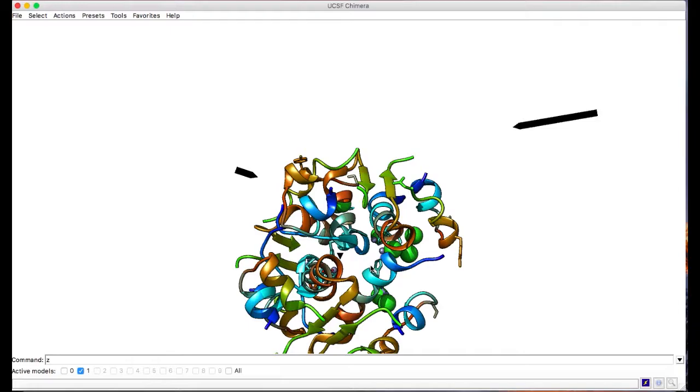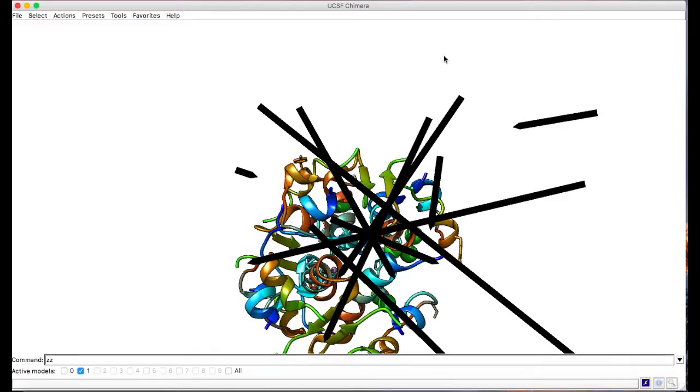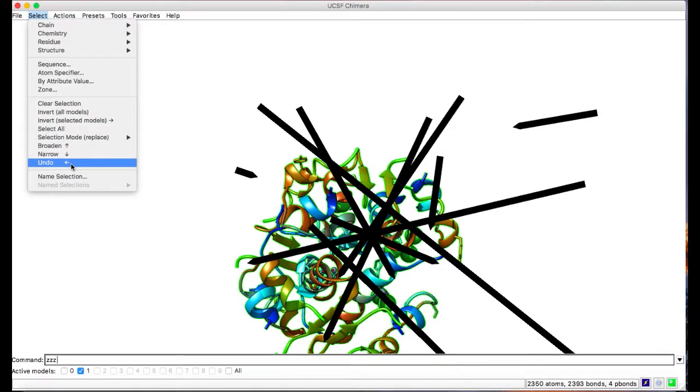Now, a big problem that could be quite relevant to discuss with UCSF Chimera is going back. So let's say I'm talking to my supervisor, I'm playing with my computer, and I'm adding all of this. Well, you could be tempted to go, oh, maybe I'm just going to go back. And then you press Command Z or Control Z, and you see that nothing is working. Well, there's one way you could do it, which is undo right here.